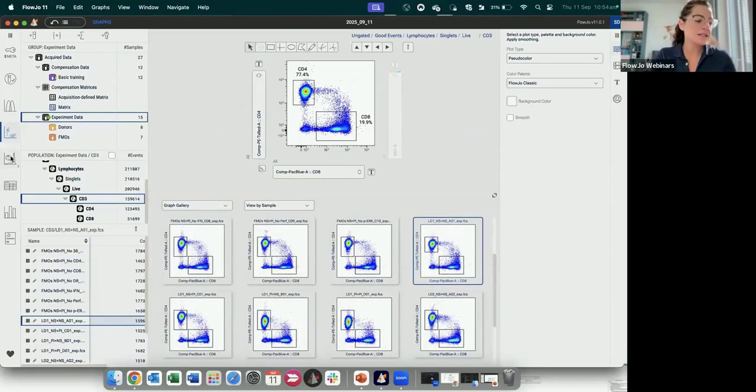The next icon is the advanced platforms, which we will not use today because it's high dimensional analysis. So this is mostly an introduction to FlowJo. So the idea is to give a webinar for people that are starting to use FlowJo or are starting flow cytometry. So I don't want to be too much specific on these or go too deep dive.